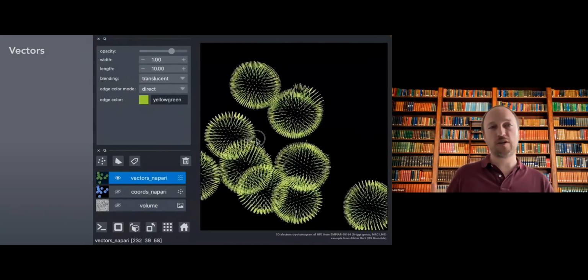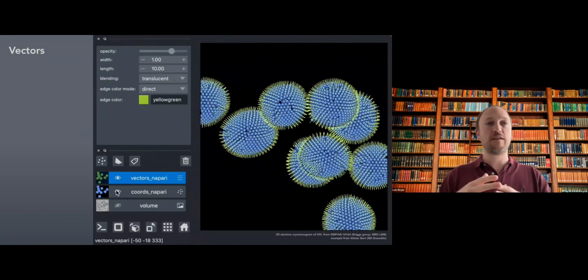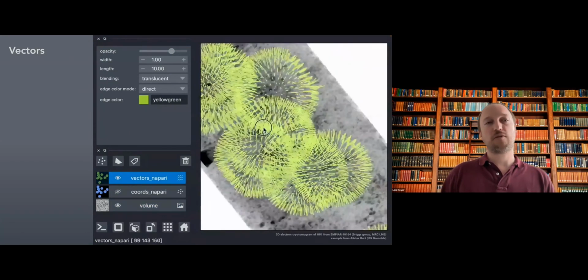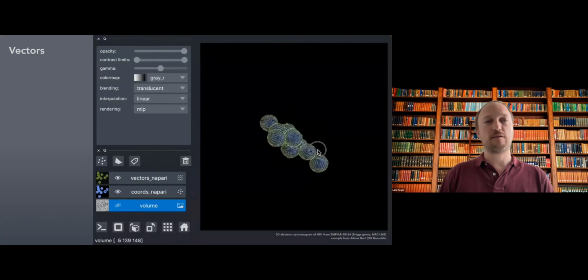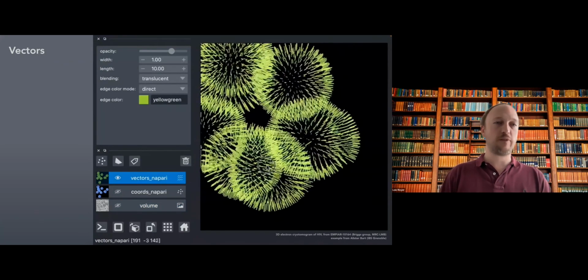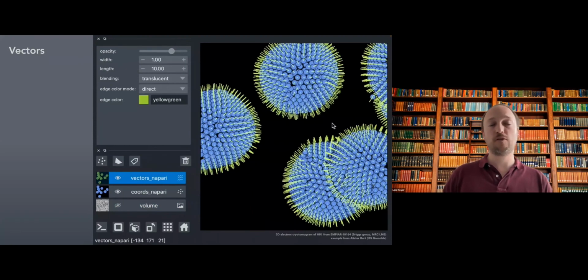And all these features cross-fertilize, so you can potentially imagine doing that also at large scale with very, very large images, and so on and so forth. Of course, there's a lot of work that we need to do to be fully capable of rendering data at very, very large scales in a lazy way. There's a lot of complex programming and complex work there, but we're moving towards that slowly but surely.